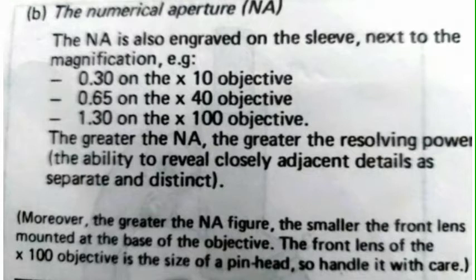The greater the numerical aperture, the greater the resolving power, the ability to reveal closely adjacent details as separate and distinct.